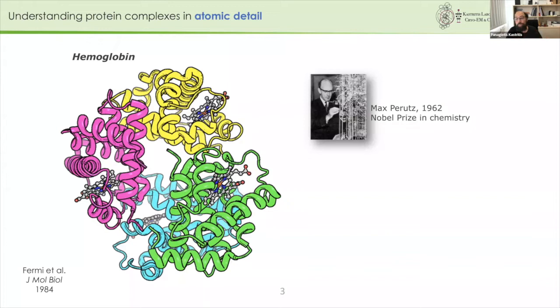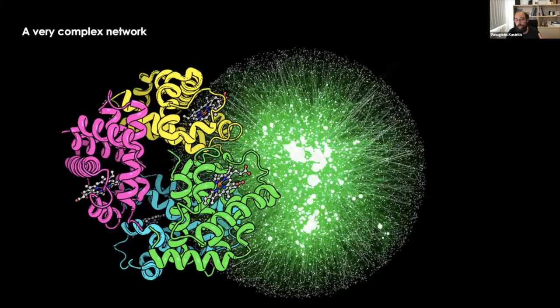So what we do is that we take each protein, either isolated from the endogenous source in very high purity, or overexpress it, and solve its structure with X-ray crystallography, NMR spectroscopy, or single particle cryo-EM. And of course, from the structure we understand function. However, we should not forget that this kind of structure-function, we understand it outside the cellular environment.